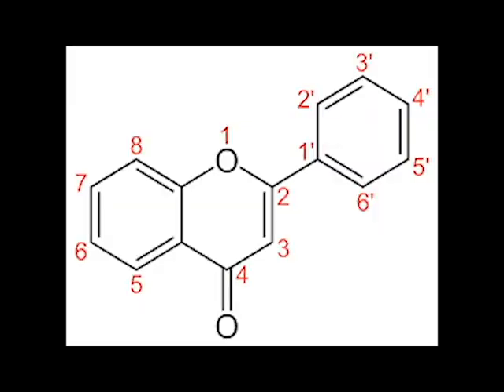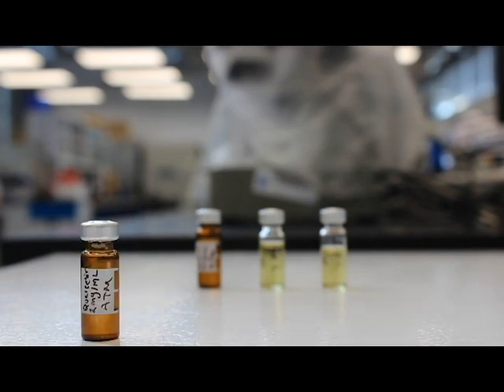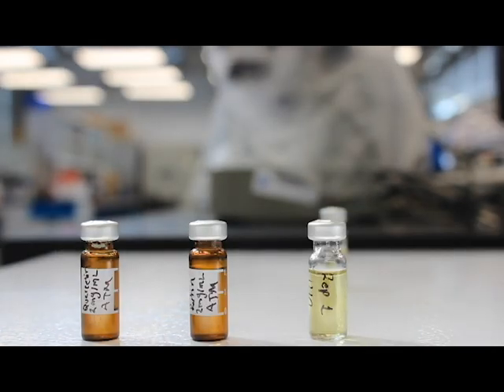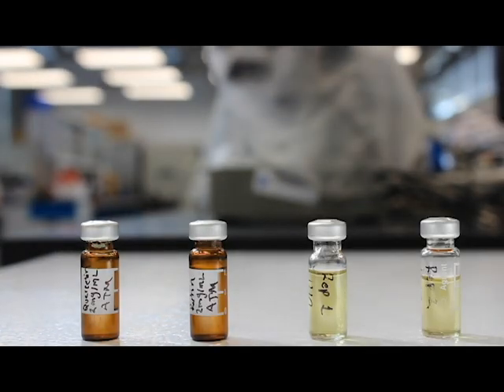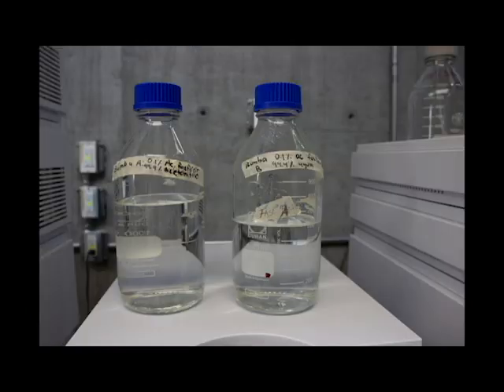So, what's next? Well, Anna is looking for a special kind of phytochemicals called flavonoids, which are polar. For this reason, she must also insert her own standardized solution of flavonoids. In this case, she will use quercetin and rutin. She must have replicas to improve the accuracy of her experiment. For this method, Anna has to create a concentration gradient in her mobile phase. For this, she prepares two solutions, phosphoric acid and acetonitrile, in distinct proportions.